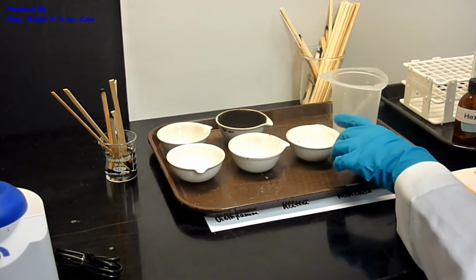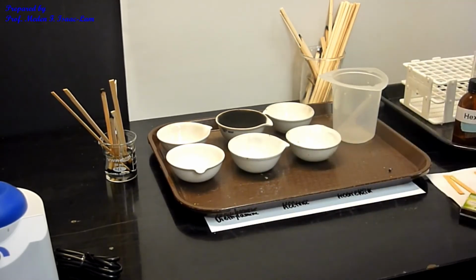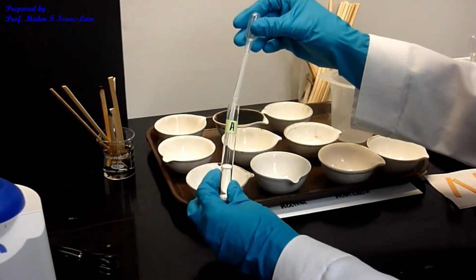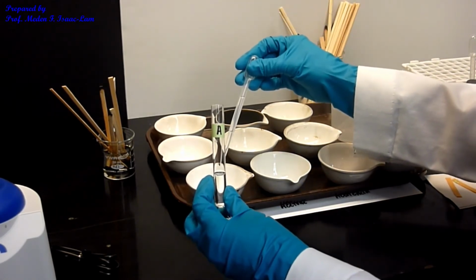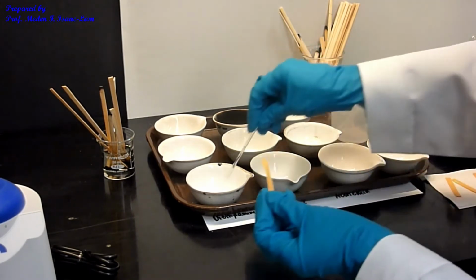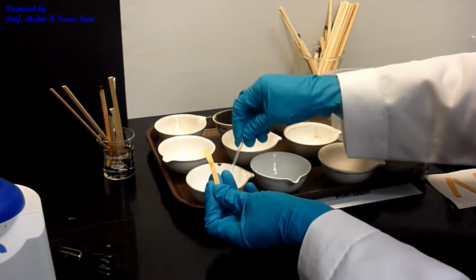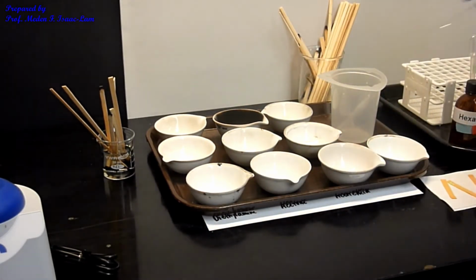Okay, so that one was ethanol. So now we're gonna do A, B, C, D, the unknowns. So this is unknown A. Alright, so we're testing the acidity. Okay, so I'm gonna put it here. So acidity for that one is almost neutral, 6. Okay, so that's the unknown A.